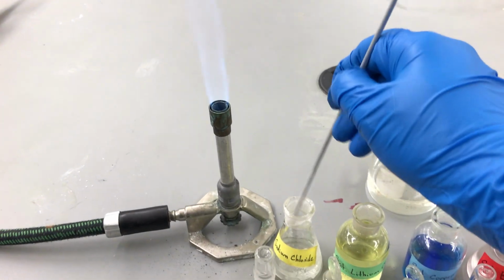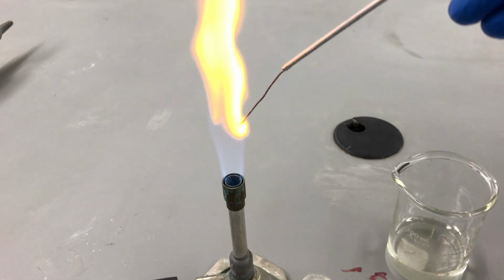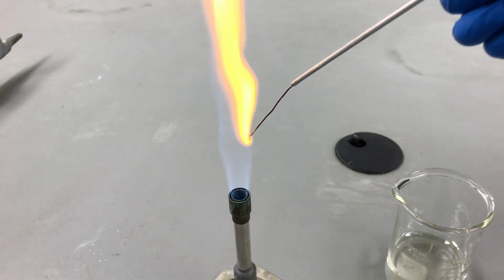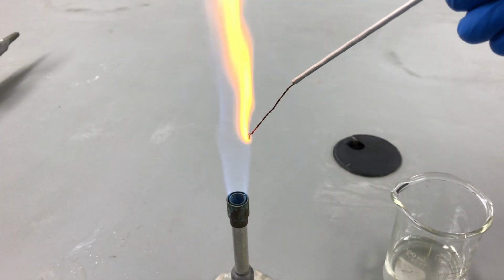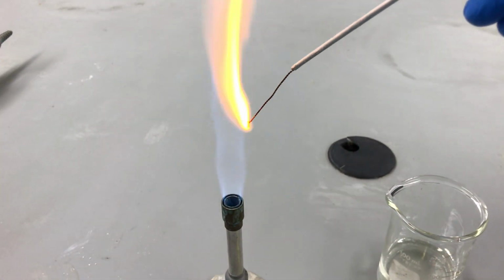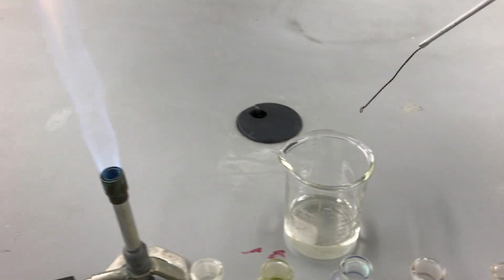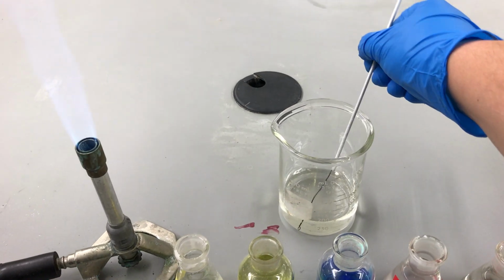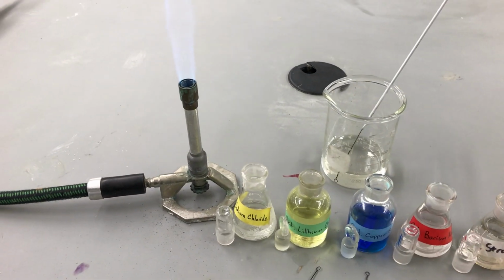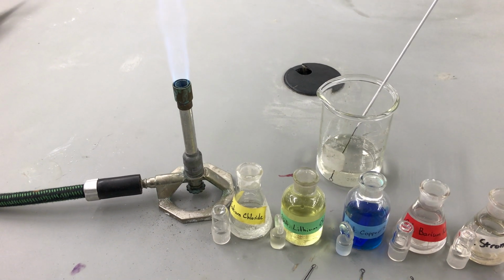Let's do that again. It's the same color as the sodium lights you see out on the highway, the street lights. They are sodium vapor lamps, and they give off the exact same color. So sodium is that nice kind of yellowish orange color. So once again, to decontaminate, we're just going to place it into our nitric acid to soak, and then we'll flame it again later. So remember, sodium chloride, kind of a very bright yellowish orange.